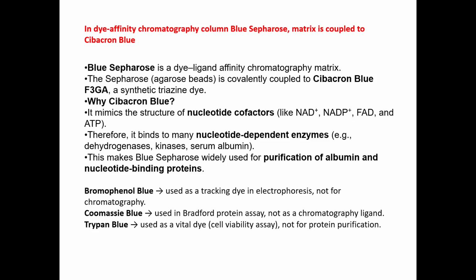It is because the structure of Cibacron blue mimics the structure of nucleotide cofactors like NAD plus, NADP plus, FAD, ATP, etc. Therefore, it binds to many nucleotide-dependent enzymes like dehydrogenases, kinases, albumin, etc. So, this makes blue Sepharose widely used for purification of albumin and nucleotide binding proteins.